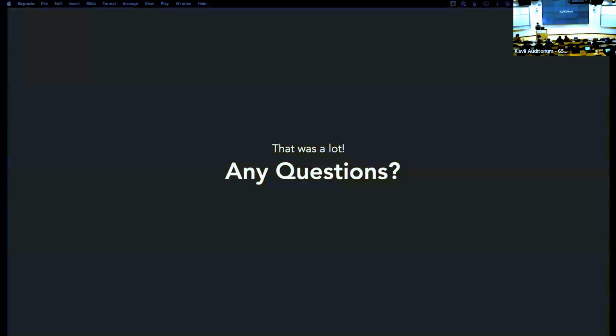And then you can go through, you have to use CryoSPARC Tools for this, and I've written an example online to do this. You can count the number of times each particle appears in the yes calmodulin or no calmodulin class. That will give you, I would say, an estimate of how many times there really is a calmodulin bound. Of course, here we're talking about single particle images again, and so you run into this problem: these things are very noisy and very low quality.